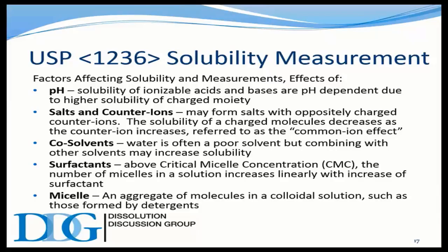Next question. Thank you so much. Okay, next question. So about the particle size, what if it is nanosized? How do we perform dissolution in an effective manner since there will be a lot of variations in surface tension?